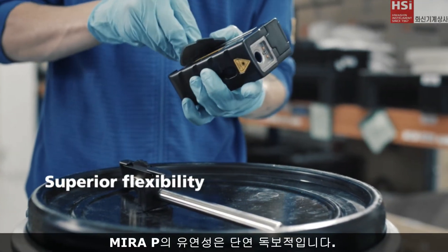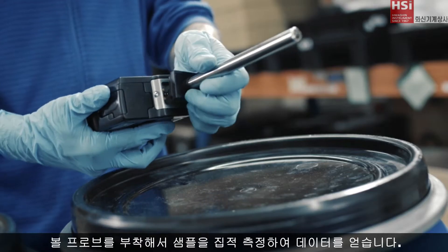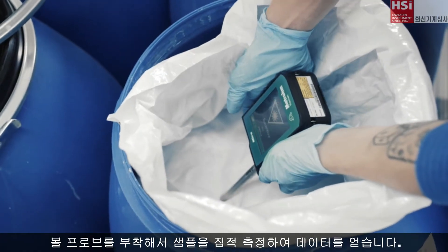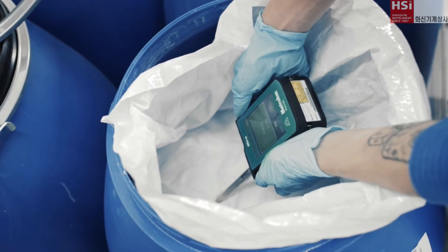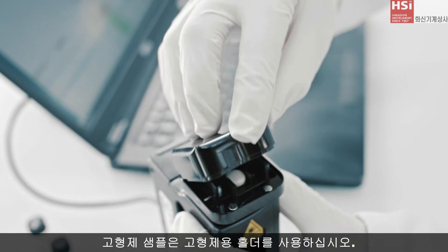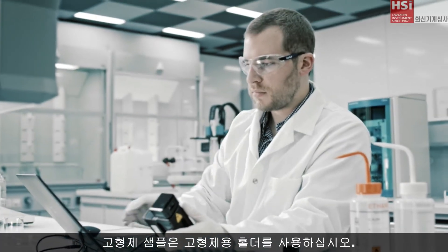MiraP's flexibility is unmatched. Use the ball probe attachment to collect data through direct contact. Use the vial holder to check samples and vials. Use the tablet holder for solid dosage forms.